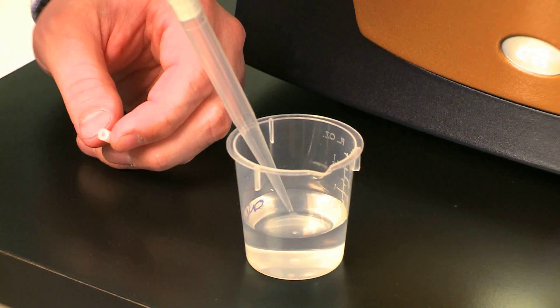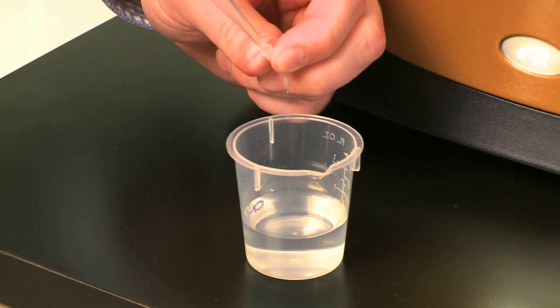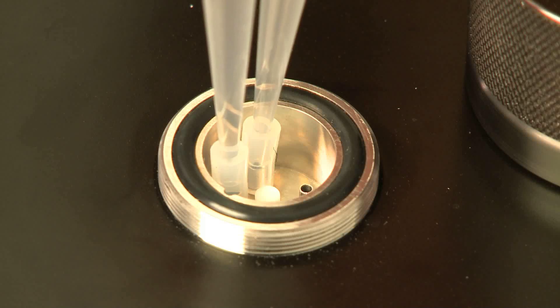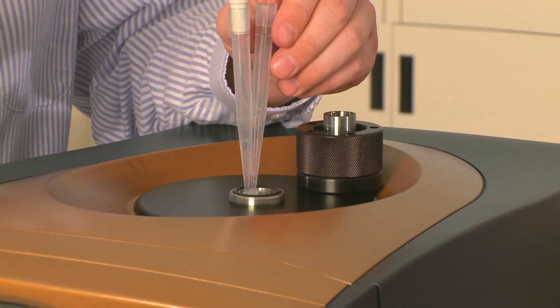Now I'm going to load a sample into the Eppendorf pipette. I'm going to place a little piece of silicone tubing on the end and load the reference side with about 600 to 650 microliters of solution.